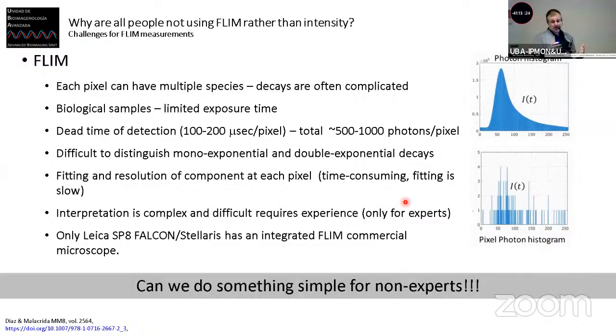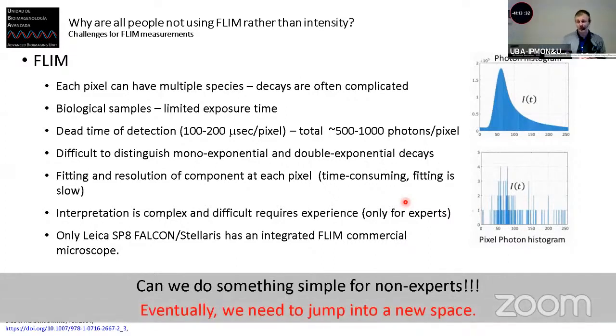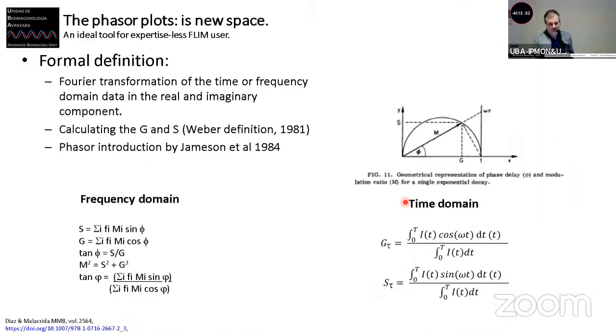So can we do something for non-experts? And I like this question. There is a chance. Well, eventually, we need to jump into a new space. And this new space, as Enrico likes to say, is the phasors. If we move from the Cartesian space, intensity, decay, to another space, where everything is possible because we have other rules, other logics, well, maybe we can succeed. So Enrico already mentioned this.